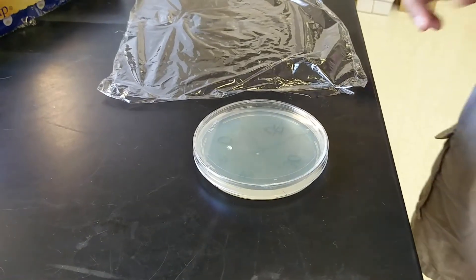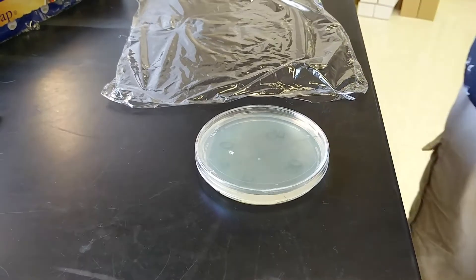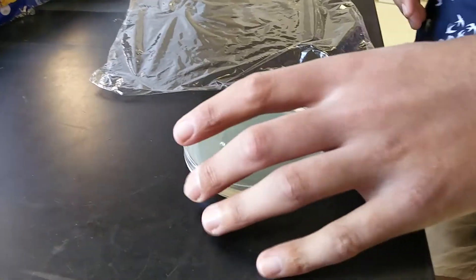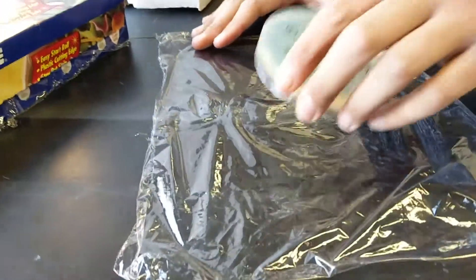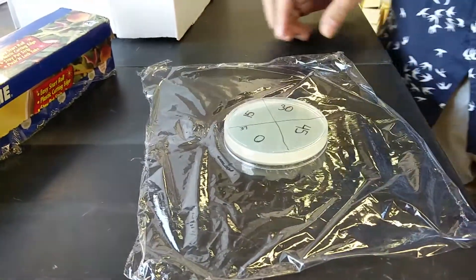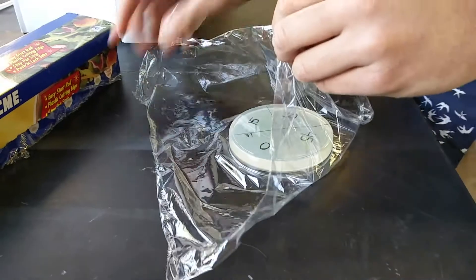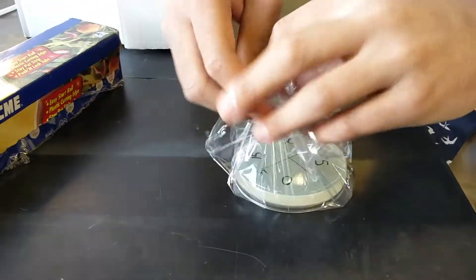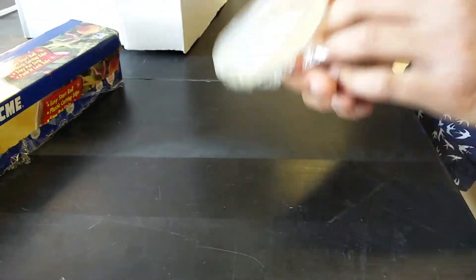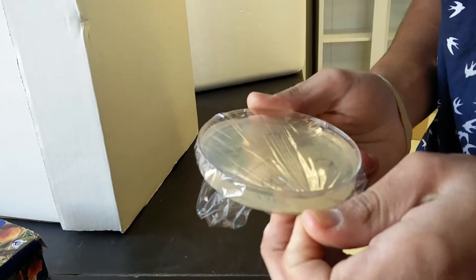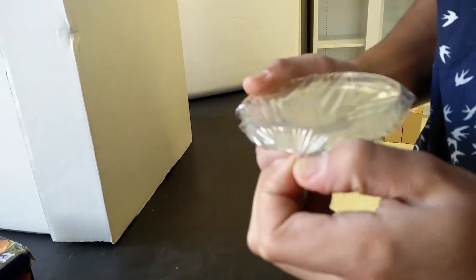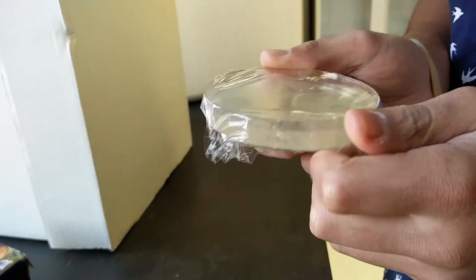You want to replace the petri dish lid with saran wrap so that you can allow the UV light to go through. Get a piece of saran wrap and flip the plate over onto the saran wrap. Take the edges of the saran wrap and bring it above the petri dish. This part is important: you have to take all the edges and tighten them so that you have as little wrinkles as possible.